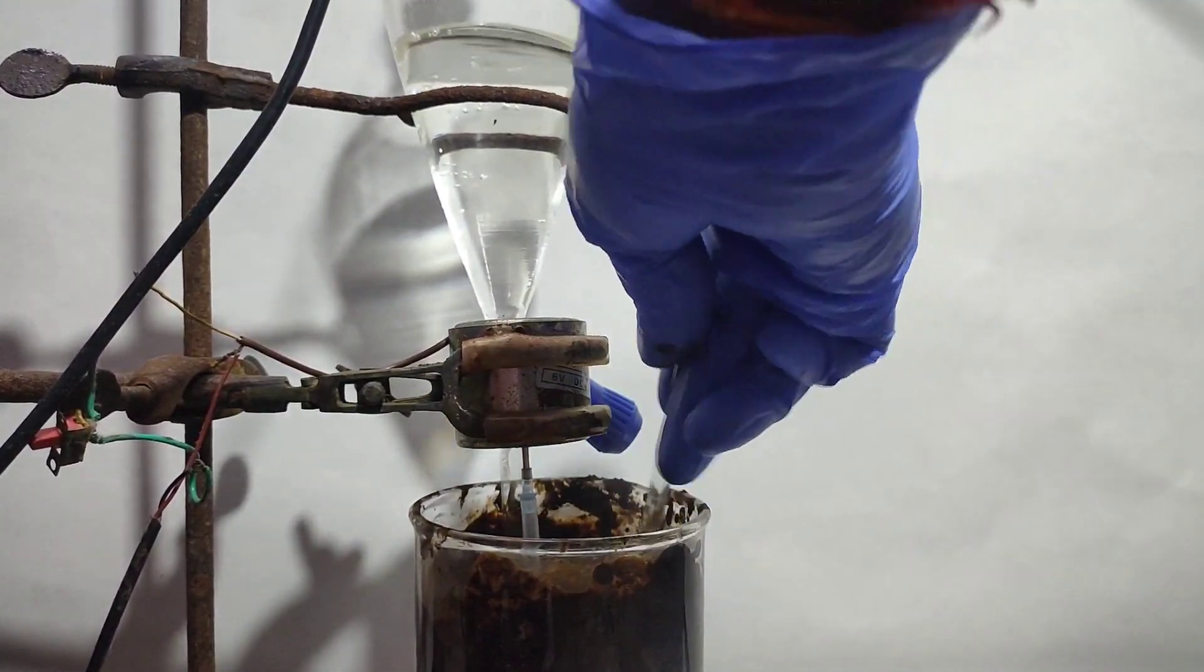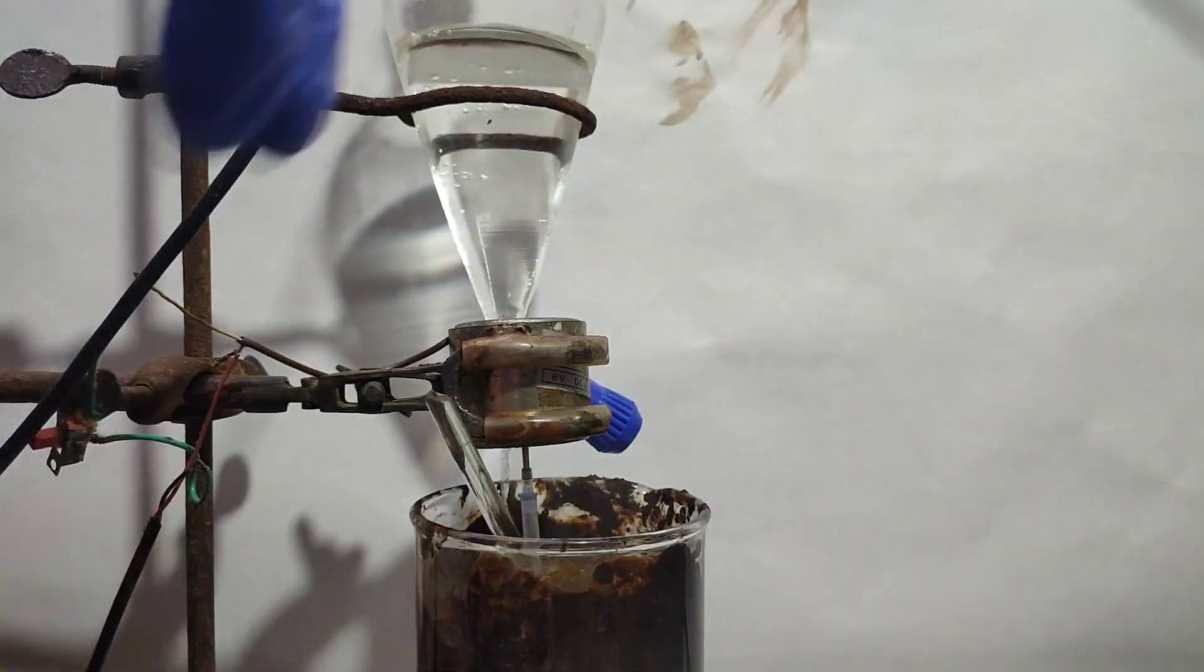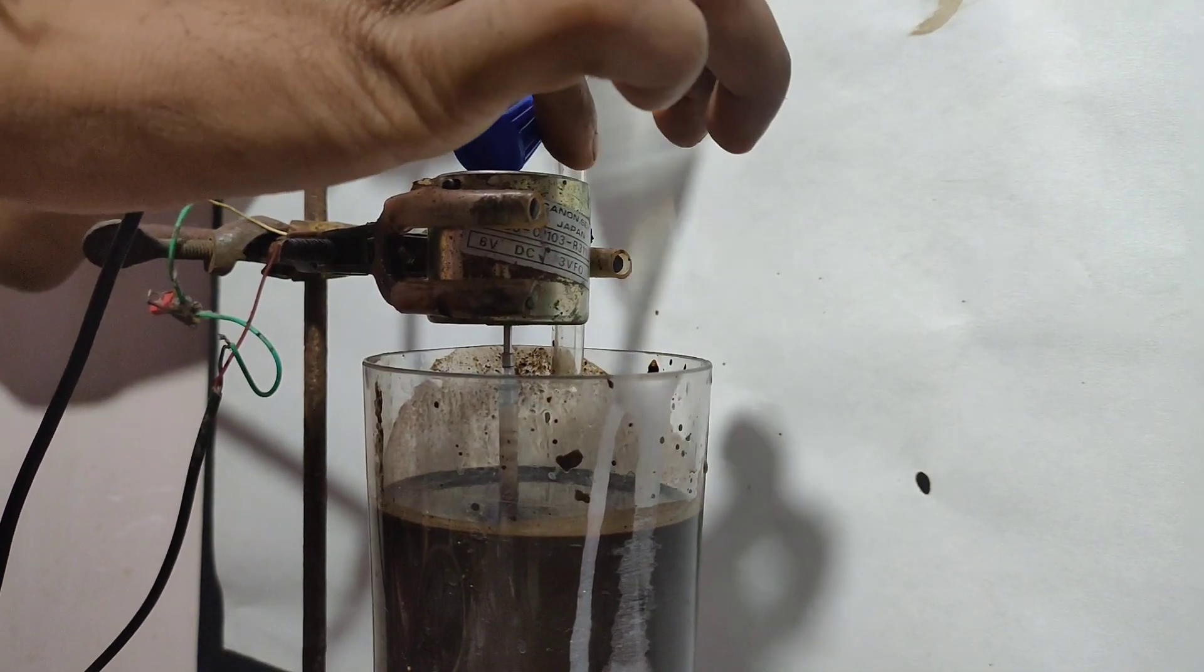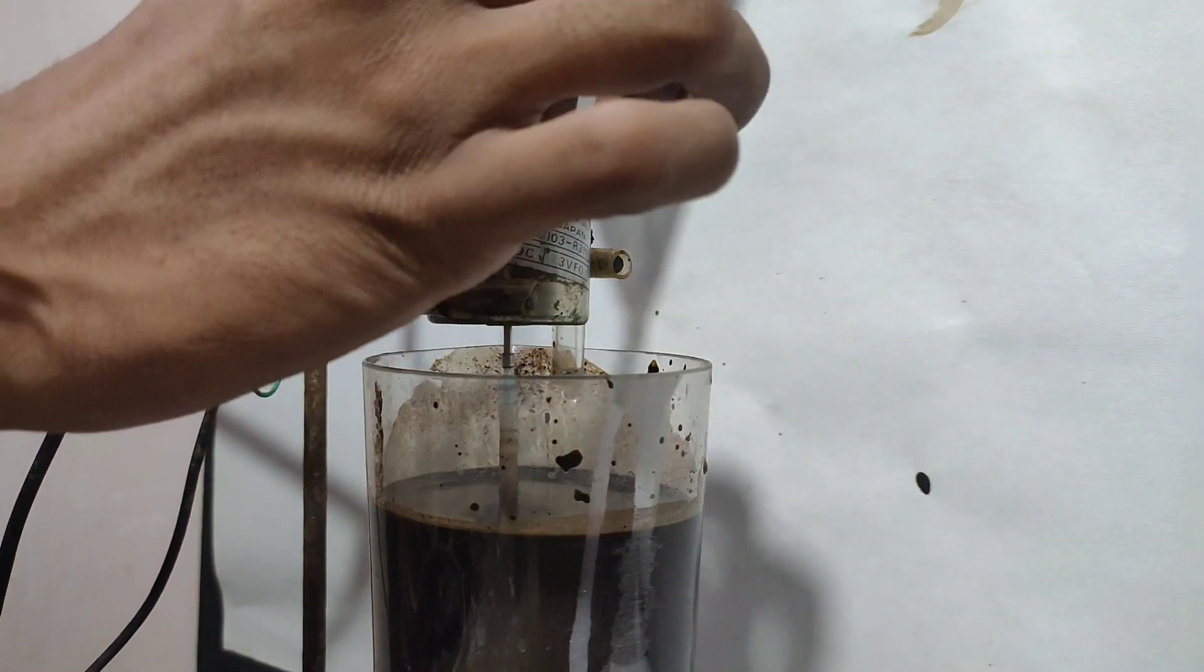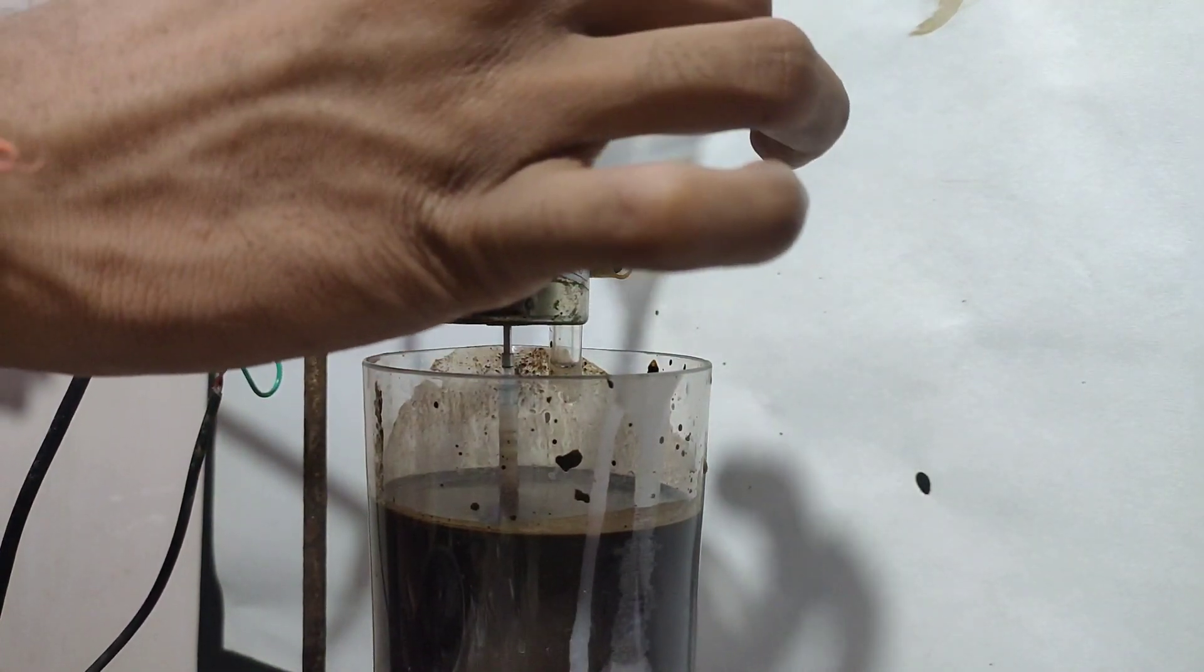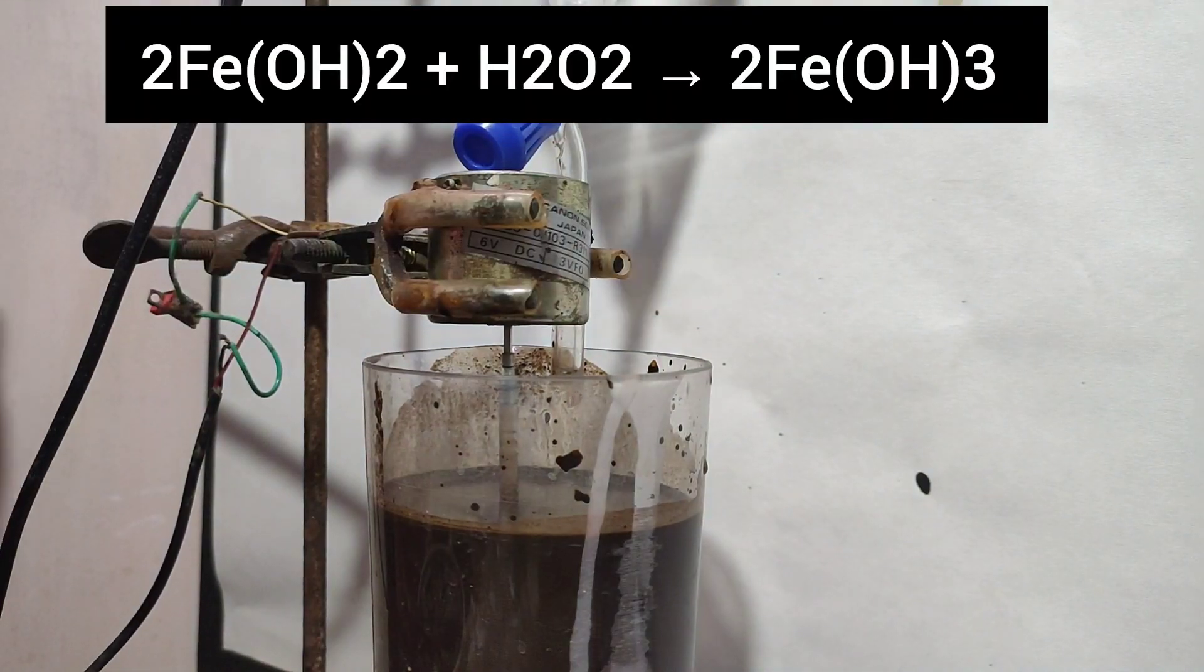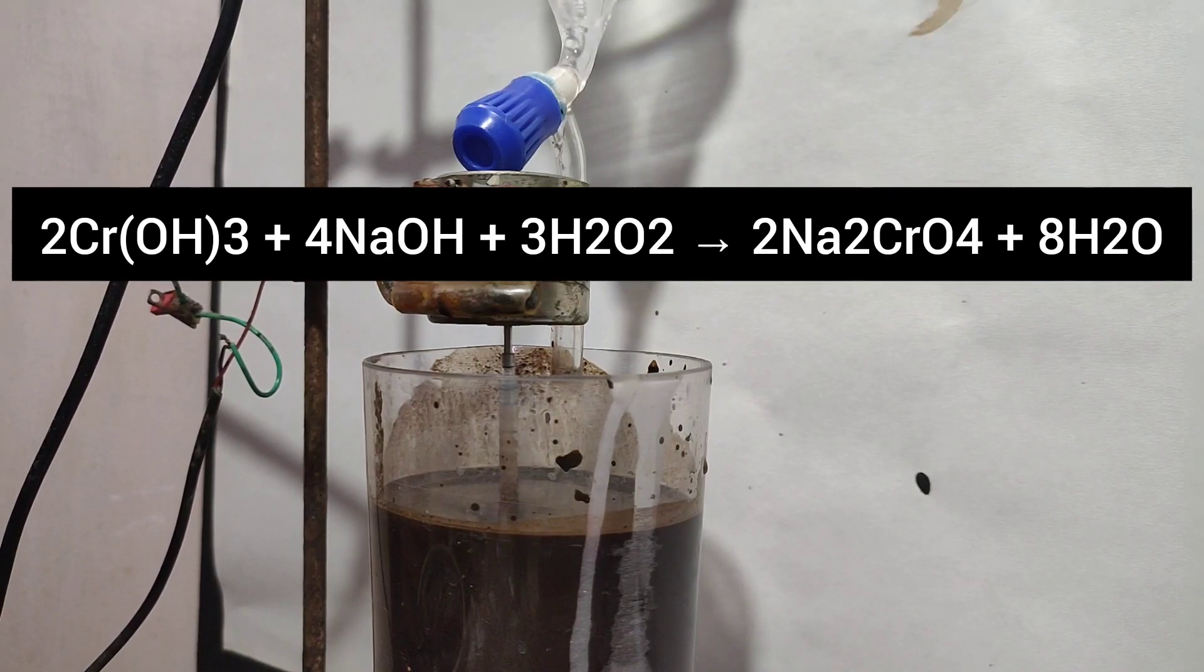As addition of hydrogen peroxide diluted the slurry, stirring became easier. Hydrogen peroxide is first used in the oxidation of ferrous hydroxide to ferric hydroxide. Then according to theory it should oxidize chromium hydroxide to sodium chromate. Here I added around 300 ml hydrogen peroxide.